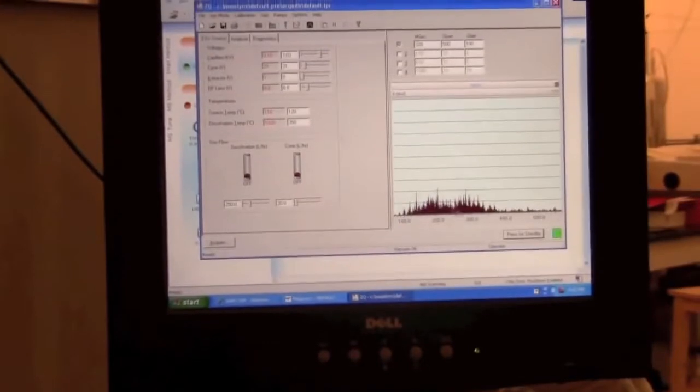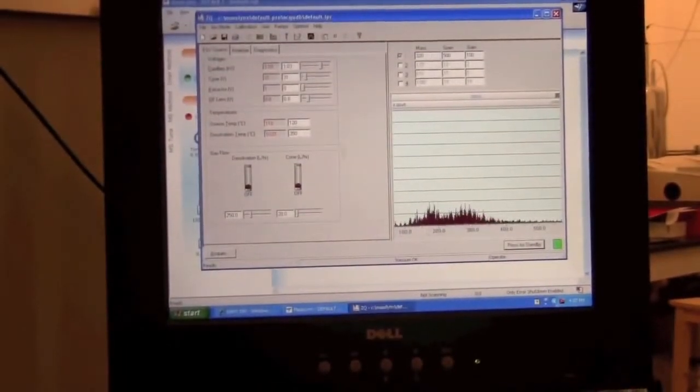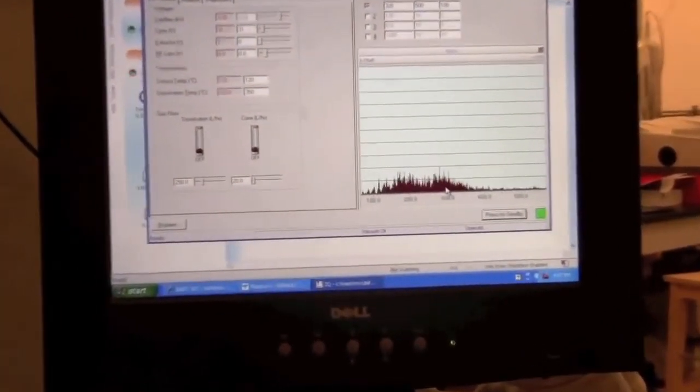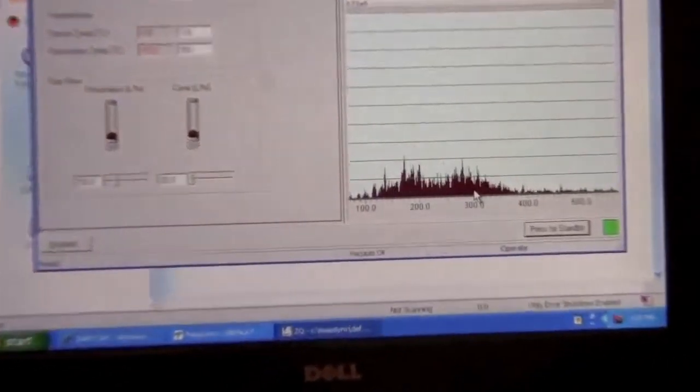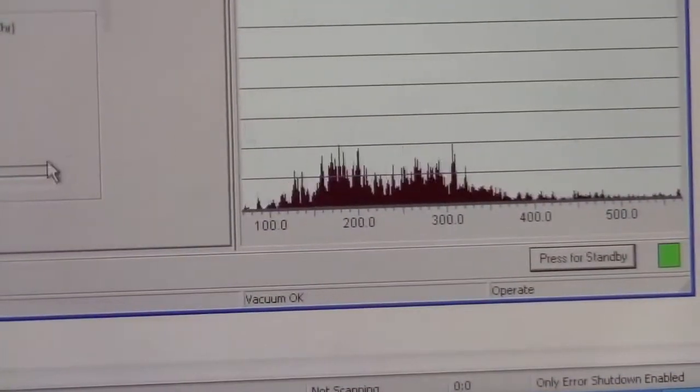If we go back here, we can see that there's a lot more ions coming into the mass spectrometer. So now we want to start an acquisition. To do that, we can click the acquire button.